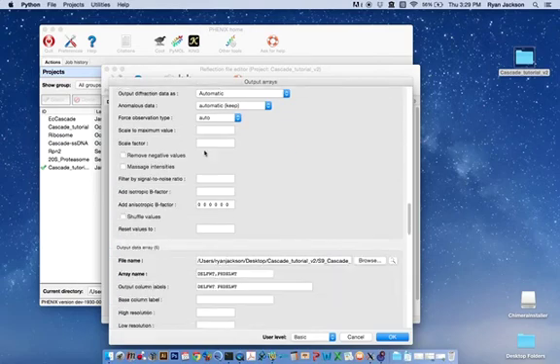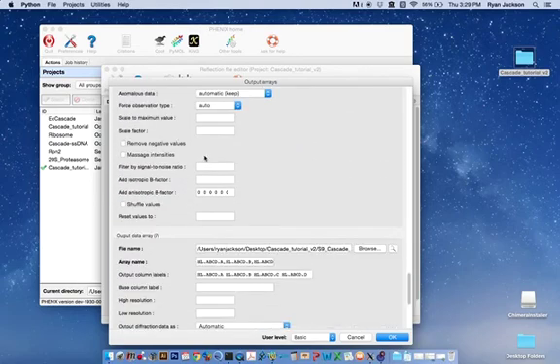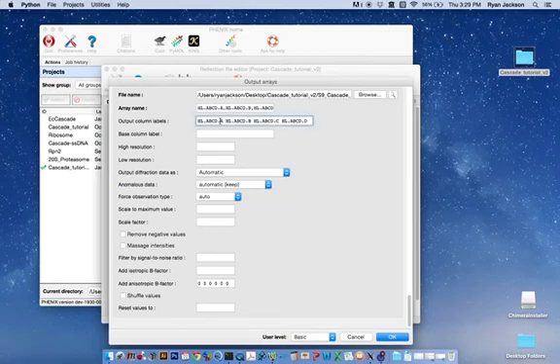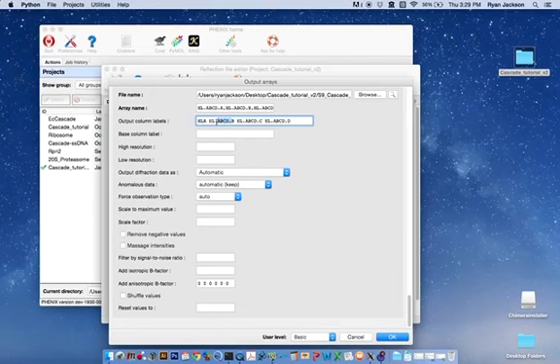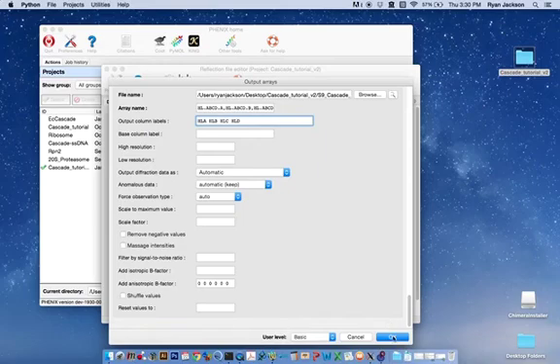Here, you do need to edit one array, which is the Hendrickson-Lattman coefficients. These periods don't work when you're merging arrays, so we need to just simplify these Hendrickson-Lattman coefficient data labels. And then, we hit OK.